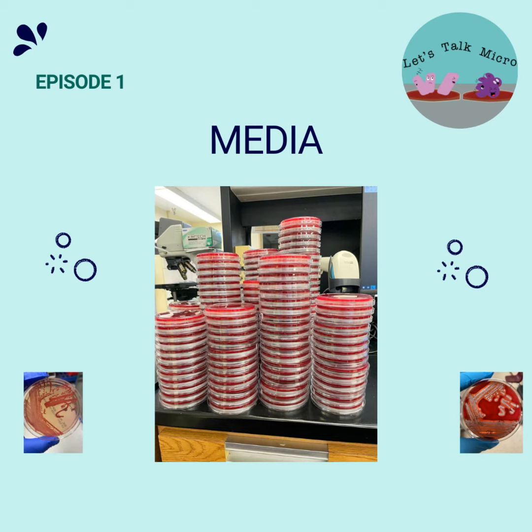And as you know, that's not true. And maybe some of you out there, some micro enthusiasts, are saying, well, if I put a Pasteurella aerogenes, it will grow. And for that, you will be right. But overall, the other Pasteurellas, like Pasteurella canis and Pasteurella multocida, are not going to grow in MacConkey. Pasteurella aerogenes is an exception.